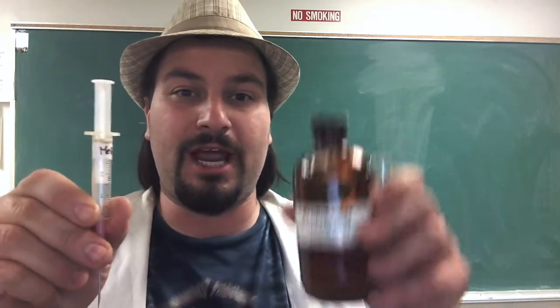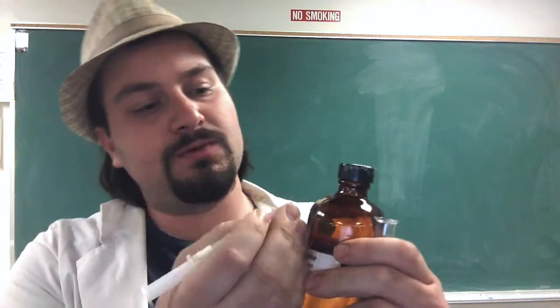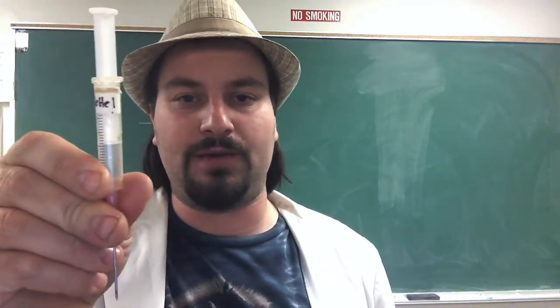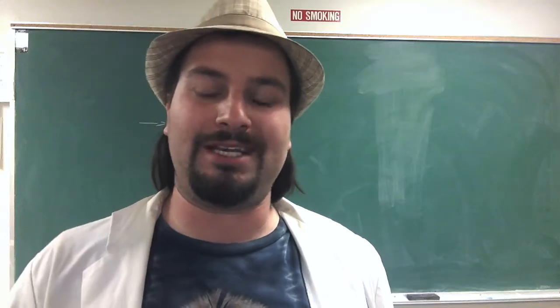Also, notice that the syringe and the bottle will both be labeled. This one has MEHE1. This has MEHE1. The other bottle, MEHE2.